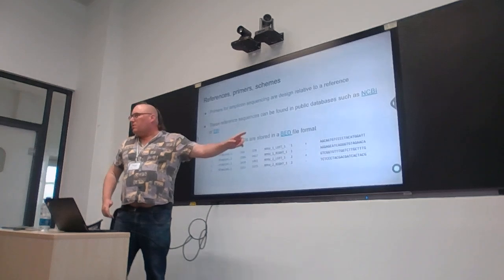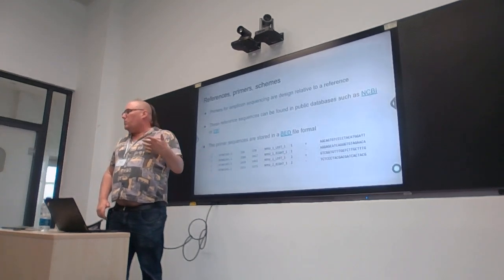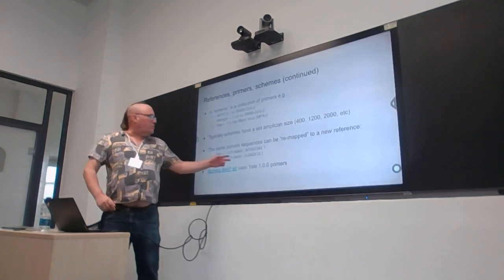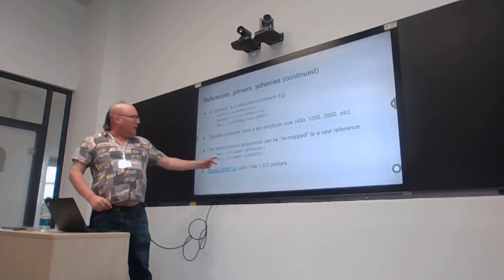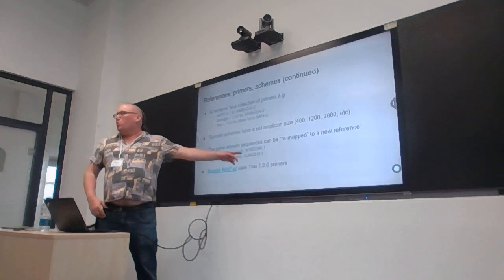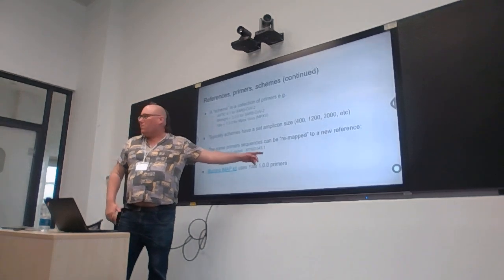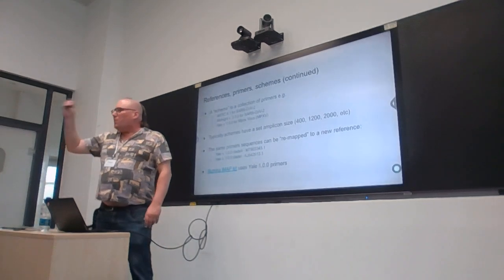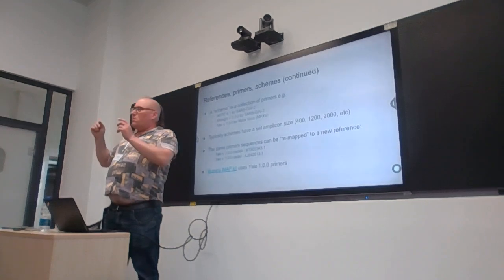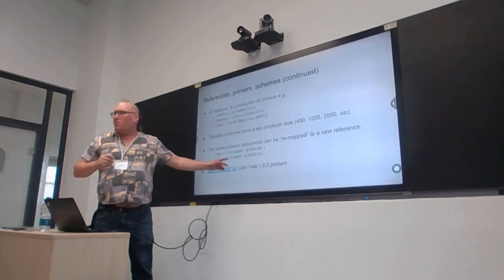They've translated them into the coordinates that match the reference sequence for clade 1 instead of clade 2, okay? So if you get the Yale, and you see it's called Yale version 1, clade 1, then it uses a reference sequence called KJ642613, okay? What this just means is it changes the positions of the primers around. What doesn't change is that it's still Yale version 1, okay?